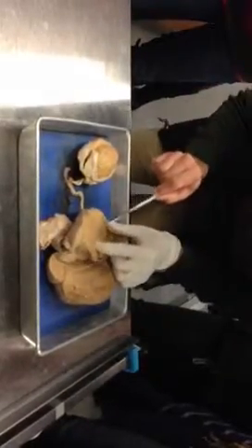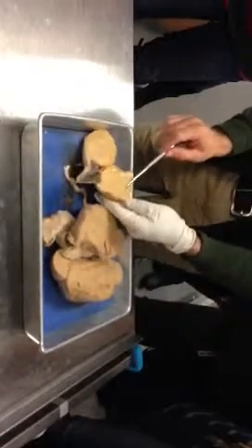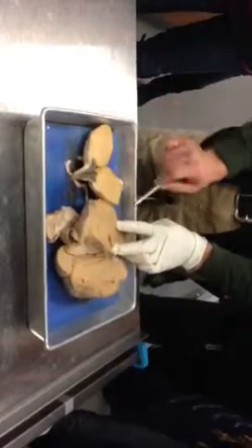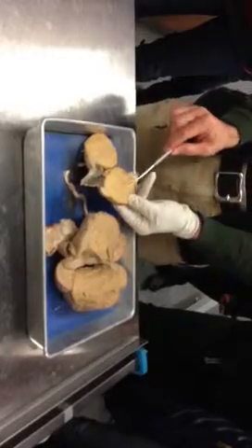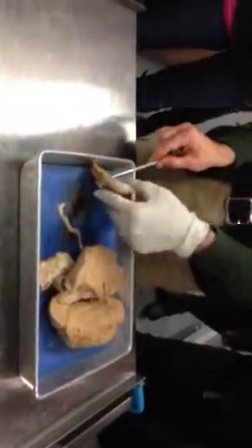Okay, so all of these, if you look real close, you can start to see little tubules. And it's the same thing over here, a little finer in the sheep testicle, but all this matter inside of the testicle is the seminiferous tubules. The rete testis is also in here, and that's the clear part, or it's whitish. This might be a little hard for people to see, so do you see the whitish area in that testis? That's the rete testis there.